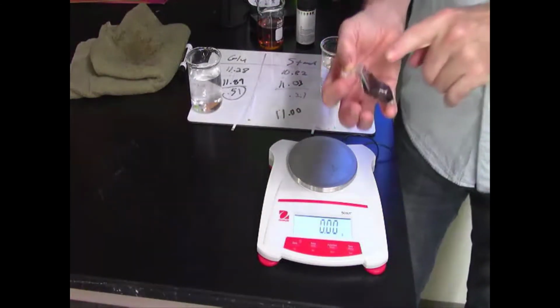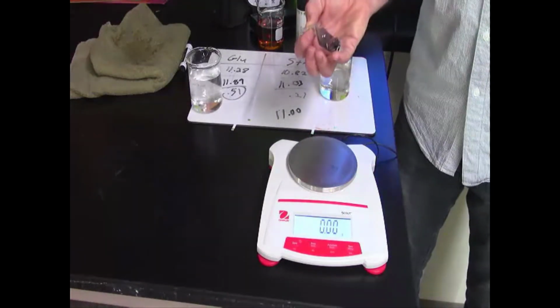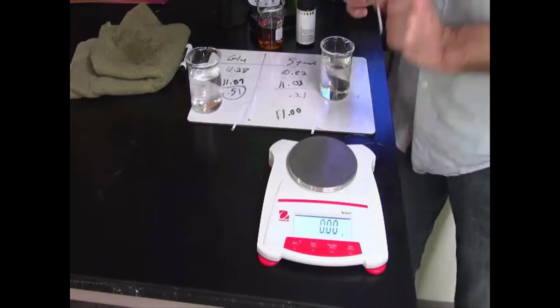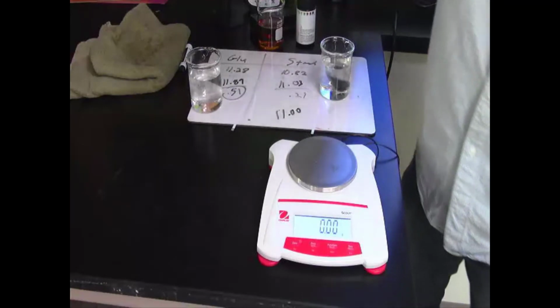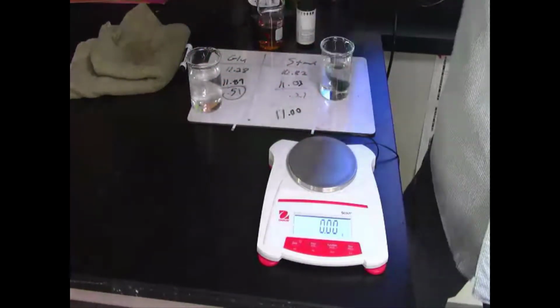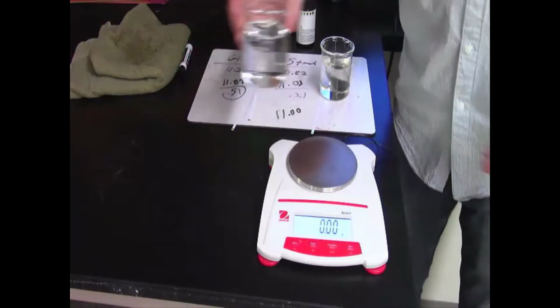Okay, but definitely it does show that there is starch inside, the polysaccharide starch inside, and the iodine is getting in through the hole. I also tested right here. I tested for glucose just in case, to see if maybe there was an enzyme in there that was breaking down the starch, and that's a pretty much negative test. So no glucose.